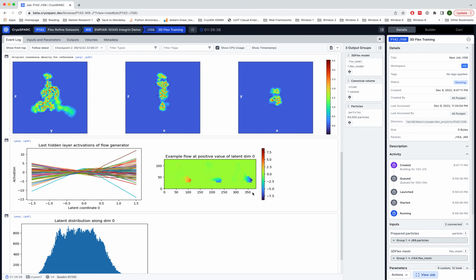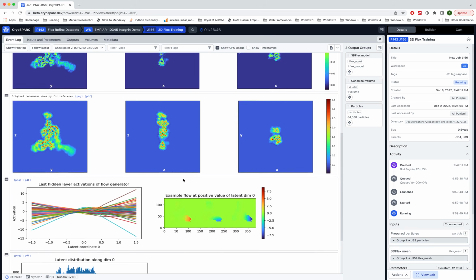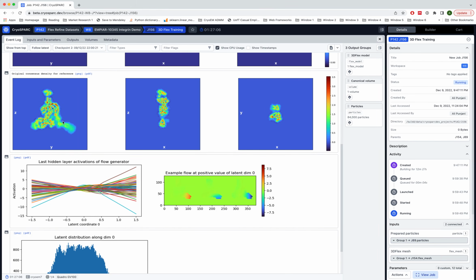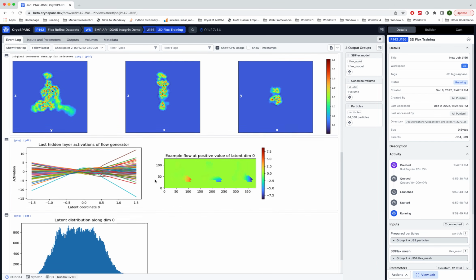On the right-hand side, we have another diagnostic that shows, with 3 images of our protein molecule, or the tetramesh rather, the deformation that's being learned in different parts of the structure. So here, as long as we're seeing some values, and the color bar shows in units of pixels the amount of deformation being learned in different regions, we can see that in this block, the deformation model is learning to move this flexible arm, and that's what we expect to see. So it just gives us a sense of the magnitude of deformation that the model is learning.